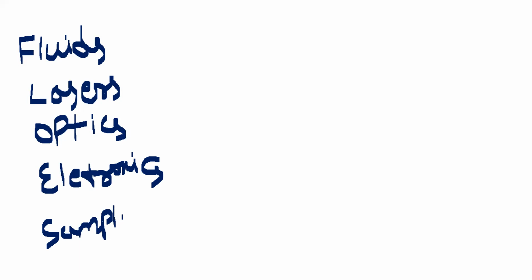These lasers are very important. Then it has optics, some optical things. Then of course it has electronic components, including the computer and everything. Electronics. Then apart from it, we need sample labeling techniques. Sample labels are also required here.